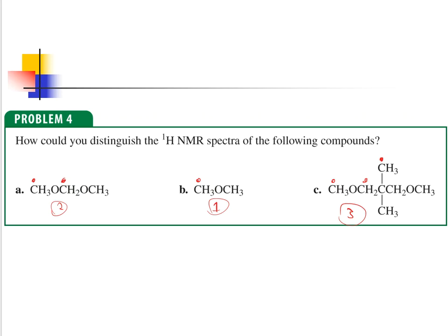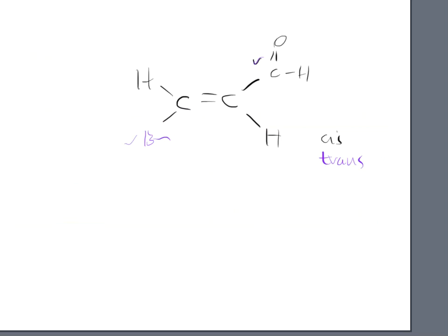So that's how we could distinguish between the H NMR of the following. Okay? All right, so that just rehashes everything that we've learned about in the past couple of videos. And now I want to go a little bit further into the mechanics of NMR and why it works the way that it does.